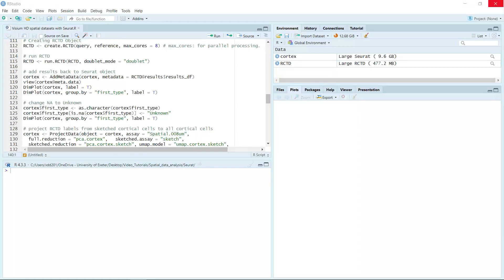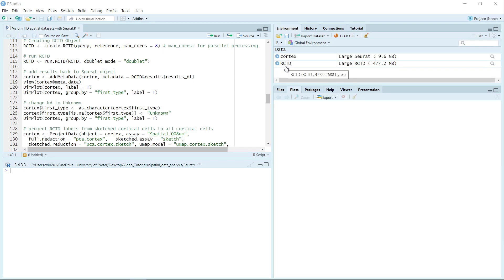Hello everyone. Welcome back to my video tutorials for spatial dataset deconvolution analysis. In my previous video tutorial, I showed you all the analysis steps until the run RCTD. Now I finished this step and saved the data for the cortex object and also the RCTD object. We can click the RCTD object and have a look.